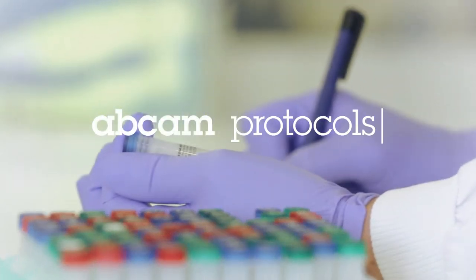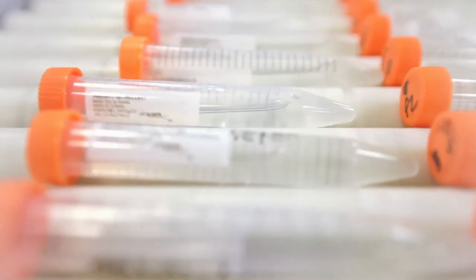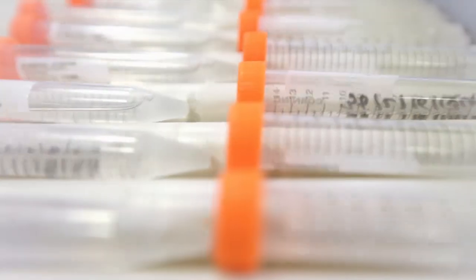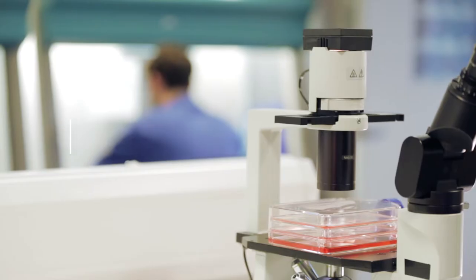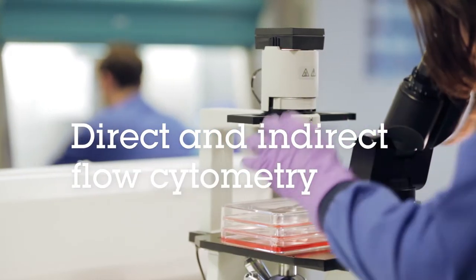Flow cytometry is a popular laser-based technology to analyze the characteristics of cells or particles. This video will teach you how to prepare and stain your cells for flow cytometry analysis.